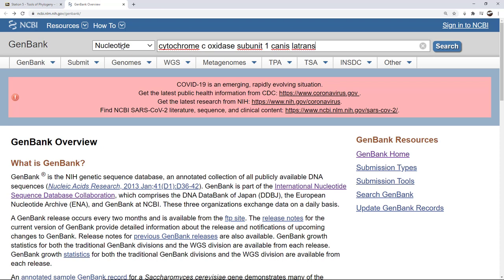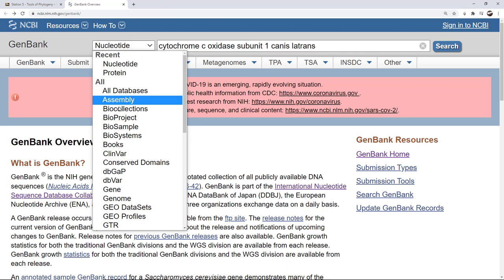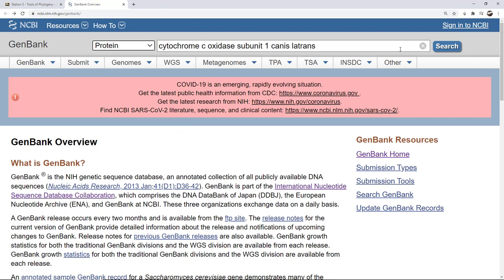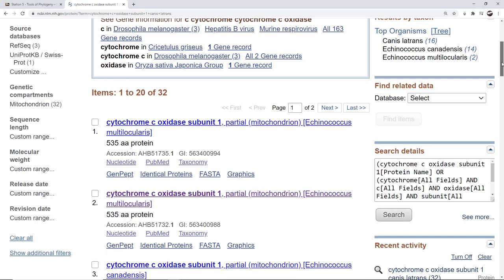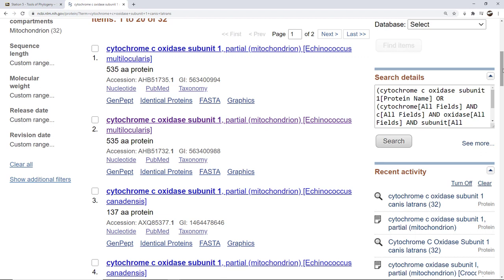I also need to change one other thing. Right now I have it set to nucleotide information, which will find the DNA sequence. But for our exercise we're going to use protein sequences. So we're going to go down here and look for protein. And now we can do a search. This is going to search for Canis latrans — the coyote — cytochrome C oxidase subunit 1 protein sequence. As I scroll down, I have to be careful and look for a few different things.